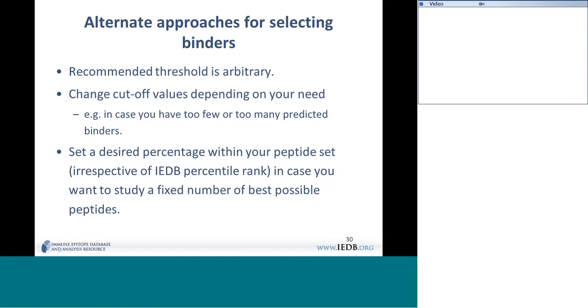I don't know if we have done any. In my knowledge, I don't know anything like that. When we do the epitope identification work, we don't do that. So what I recommend here is if you have any specific knowledge or specific information about that kind of thing, you can consider that also. You can consider this tool a prediction tool. So it's not 100% perfect. It just guides you. And with your question, whether the high binding peptides can be excluded, we haven't done any studies like that. Yeah, we can discuss that later, but we don't know.